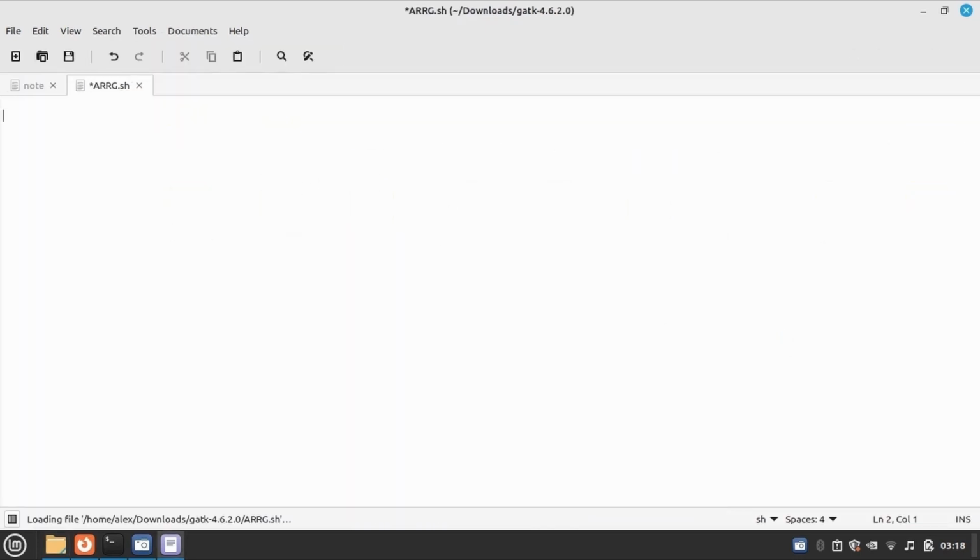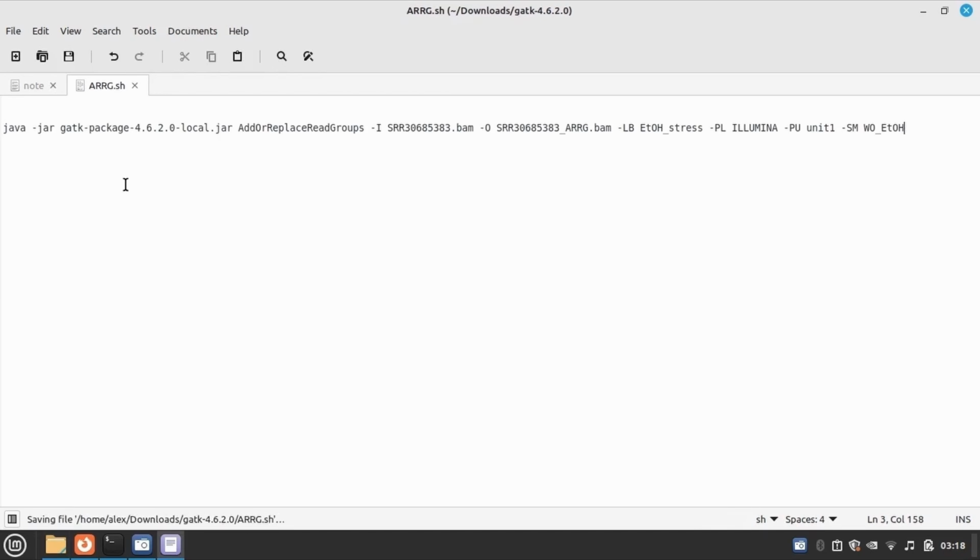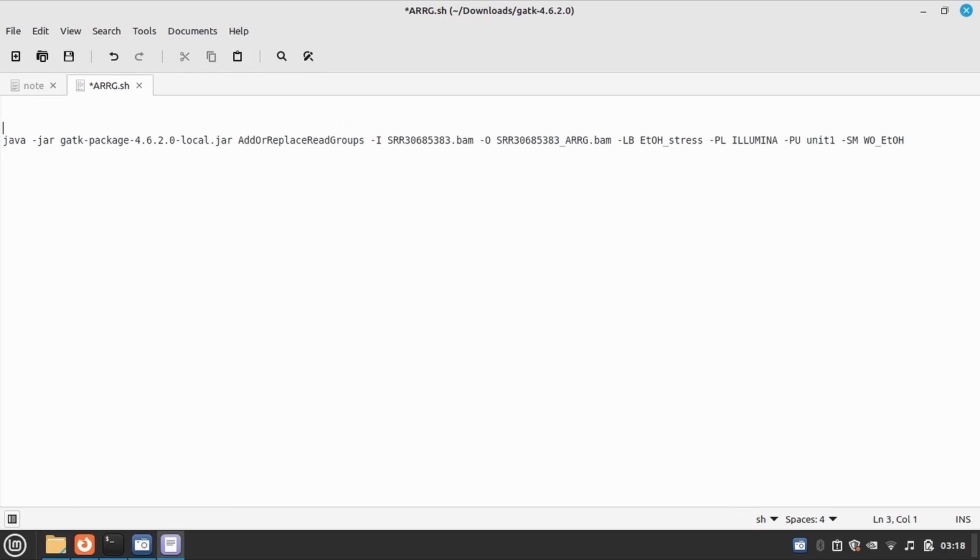Just open it and paste it. Here you have to just write this one and name it local.